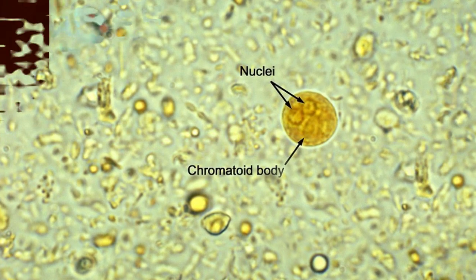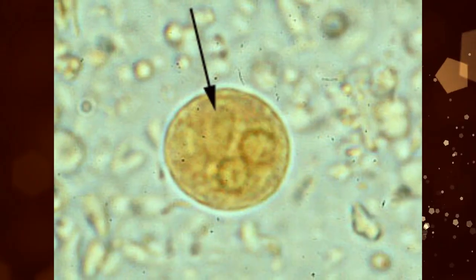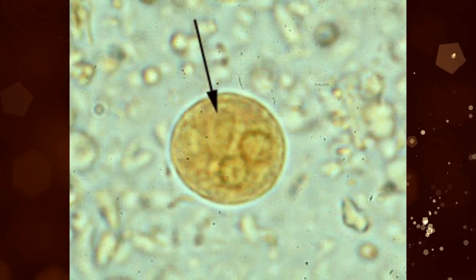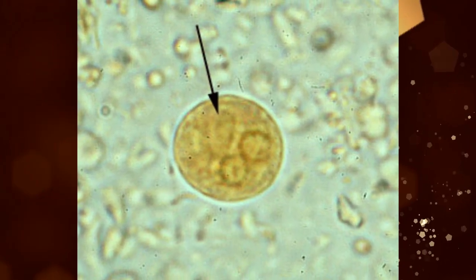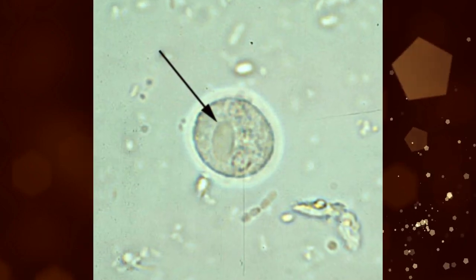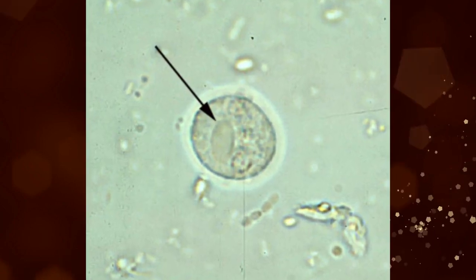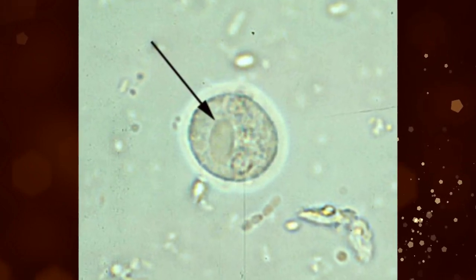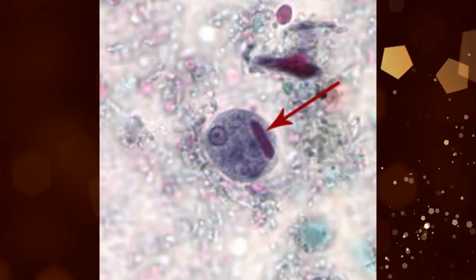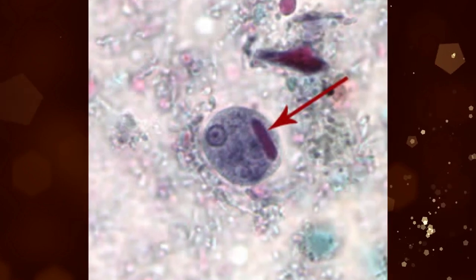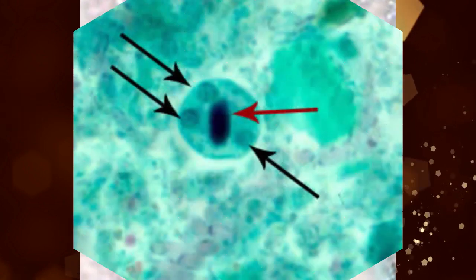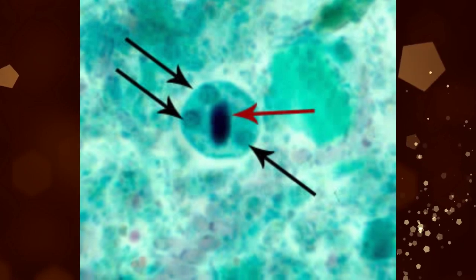The cytoplasm is yellowish gray in color after staining with iodine solution, giving a granular and dirty appearance. Cysts usually measure 12 to 15 micrometers. The membrane is thin, regular, and circular.